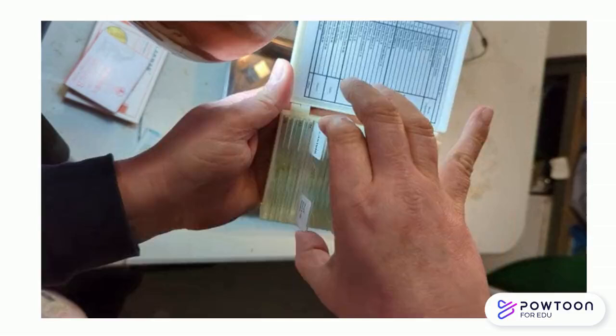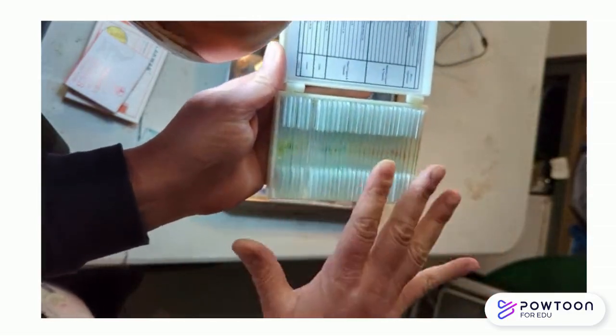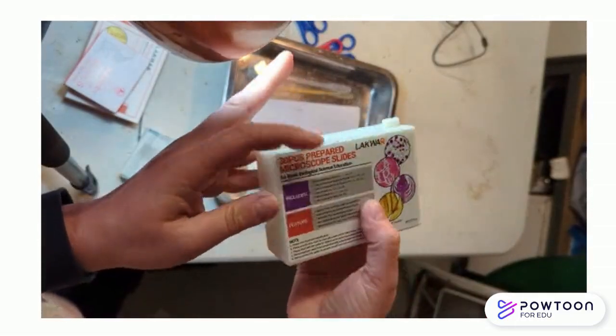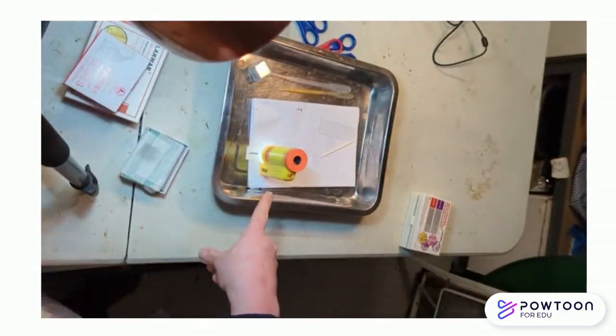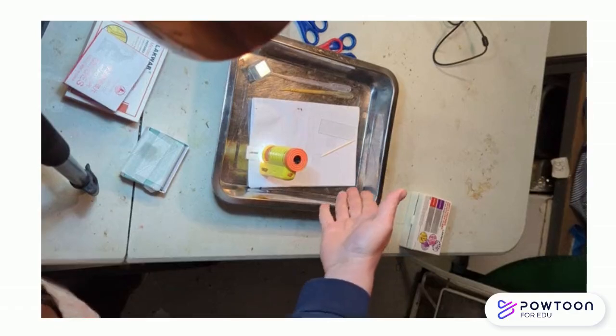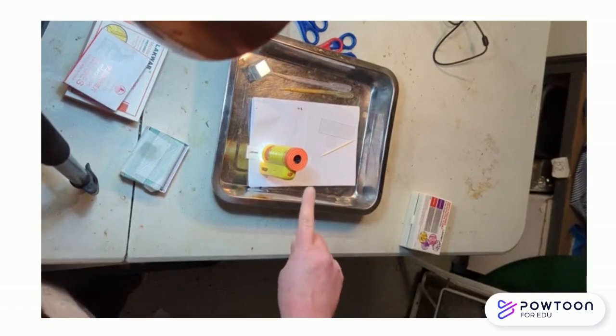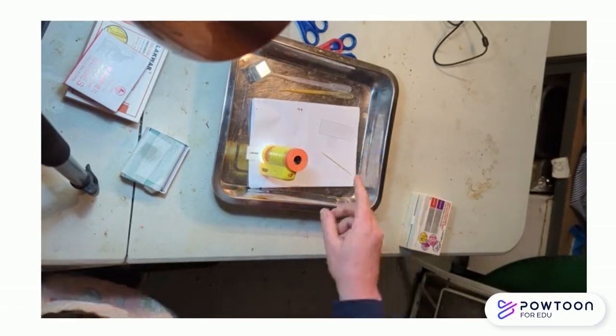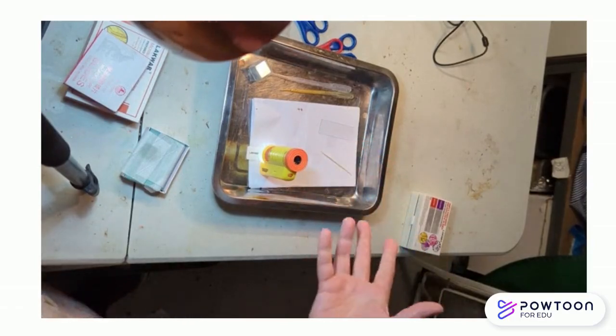When I say yourself, I mean the teacher or the assistant, not the children, because they are very fragile. Once you've got them, place them under. I really recommend that you get yourself some white paper underneath, because it really makes it easier. And start teaching them the proper technique.